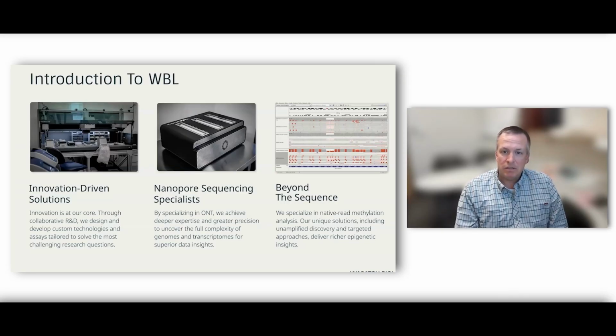Our focus is definitely on leveraging both genomic data and epigenetic data. And really, at the heart of what we do, we want to focus on taking the DNA for what it is. We don't want to modify it. We don't want to amplify it. So we wanted a technology that enabled size agnostic sequencing, where it doesn't matter exactly what size of molecule we're starting with.